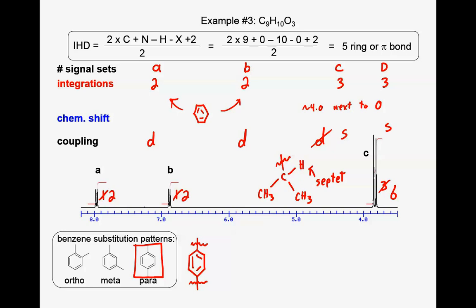So if we thought about what this could be, all right, they're singlets. Do they have any neighboring hydrogens? They don't. And so what we could have is, let's say one of these will be an OCH3. And the other one, there's not a lot to work with here, so let's again call it an OCH3. Now, if these were just 2 OCH3s and there was symmetry in the molecule, we would expect the same chemical shift.